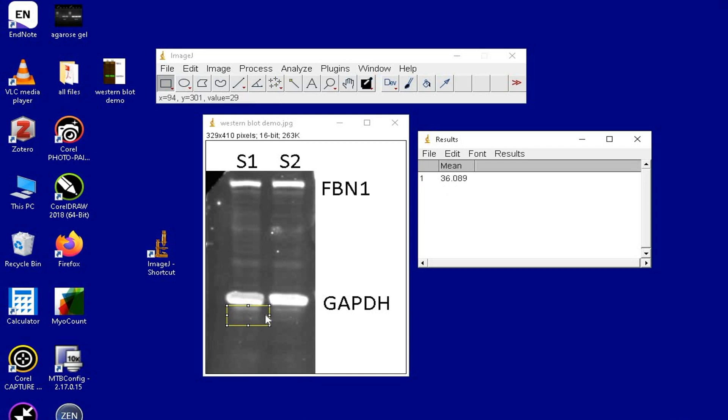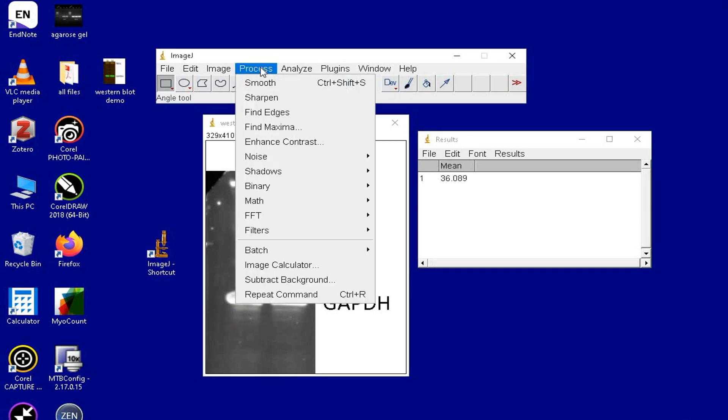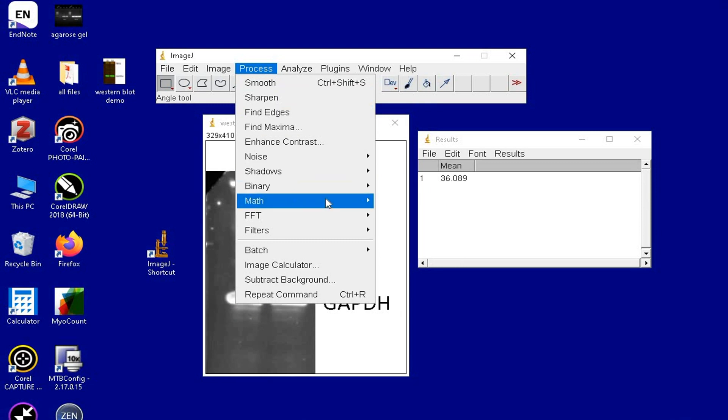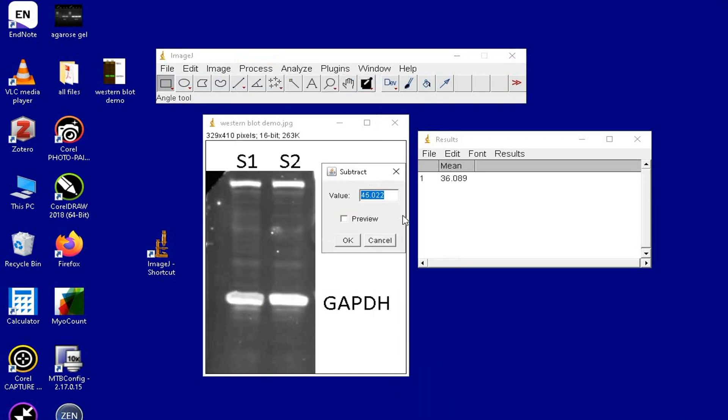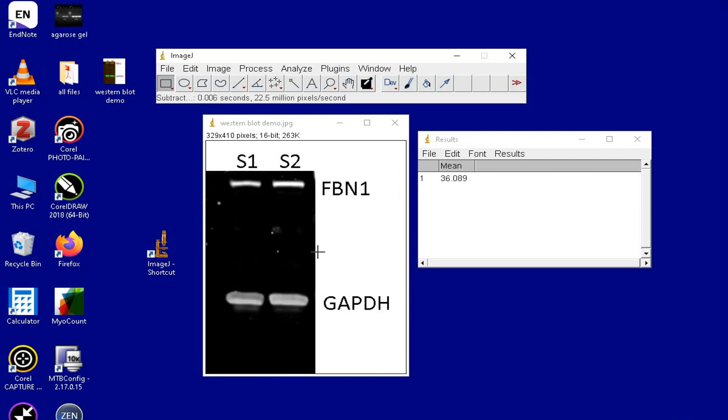Now, deselect the yellow rectangle box from the blot and click on Process, Math and subtract the mean gray value. The value to be subtracted should reflect the mean gray value of the background or the noise and then click OK.